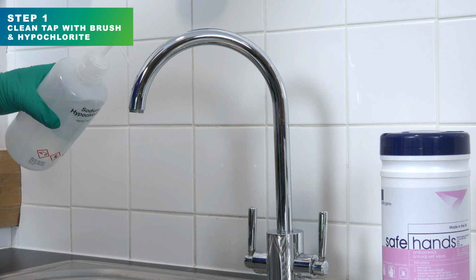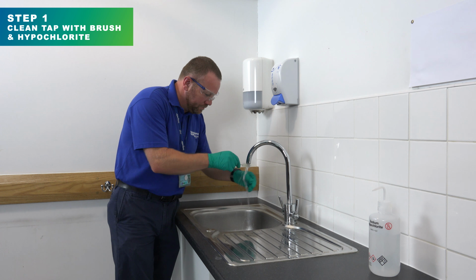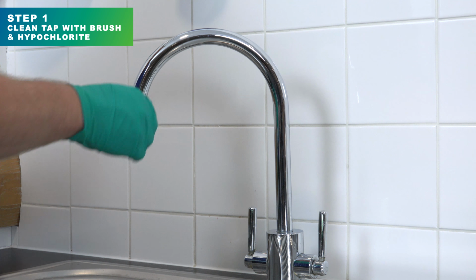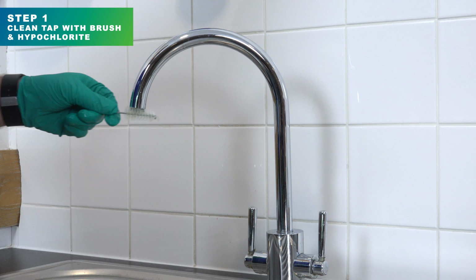The first step is to thoroughly clean and disinfect the tap using your stiff bristle brush and the 1% solution of sodium hypochlorite. Ensure that you're fully familiar with the hazards associated with your disinfection solution. Sodium hypochlorite is a strong alkali and can be particularly damaging to the eyes. Always wear safety glasses when handling sodium hypochlorite and other disinfectant chemicals. Also, be aware that hypochlorite will bleach any fabrics that it contacts, including customers' curtains and other furnishings that may be in the area.